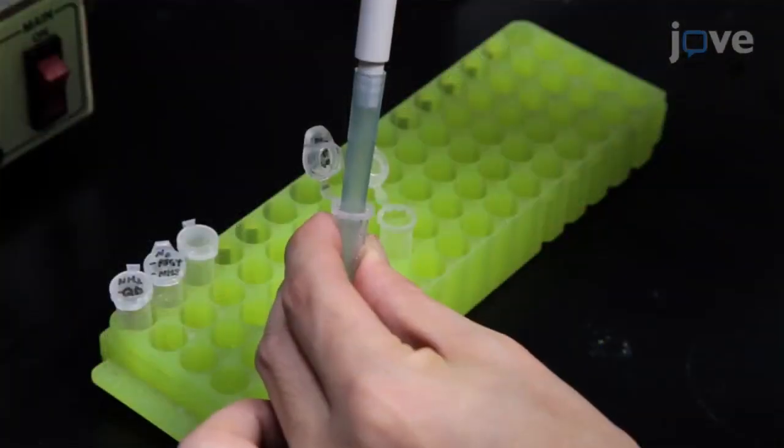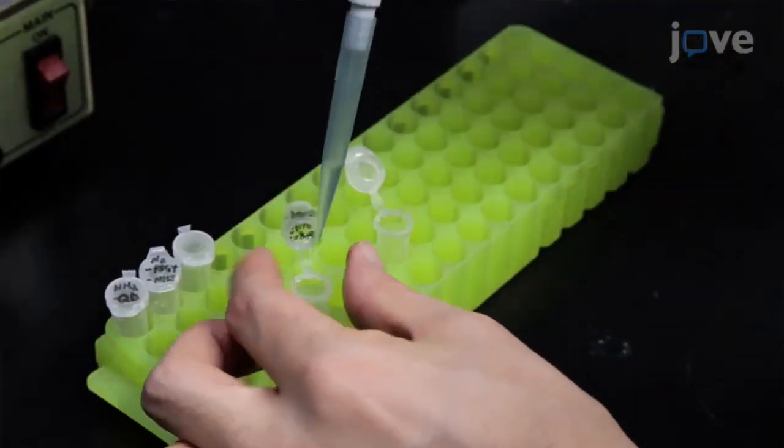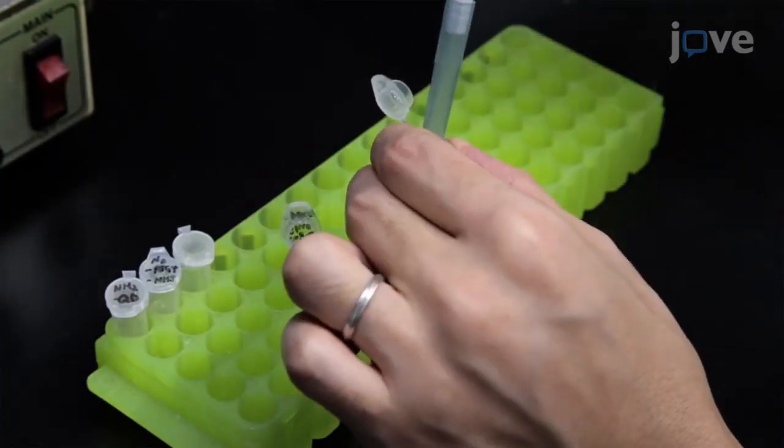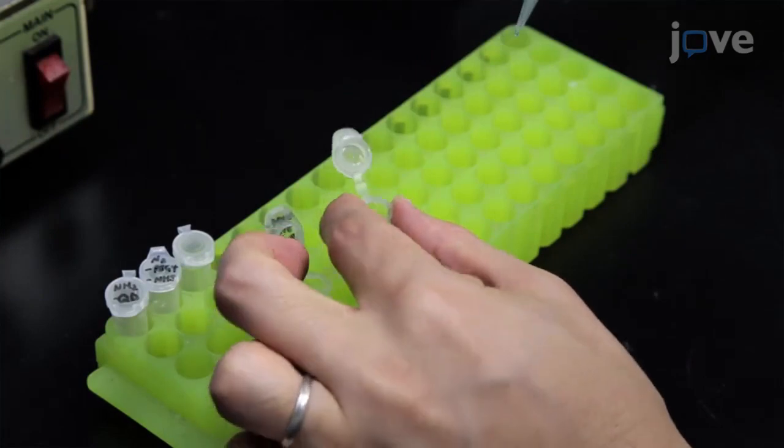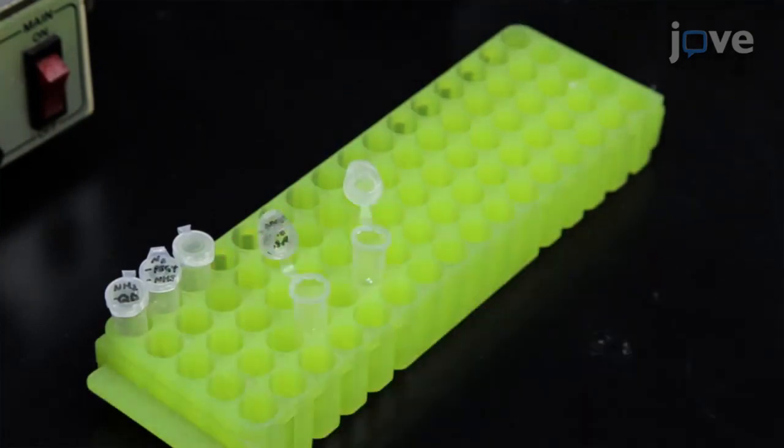Next, dilute the stock solution of caged molecular glue-linked dibenzocyclooctyne to 50 micromolar with DMF and add 200 microliters of it to the post-dialysis solution.